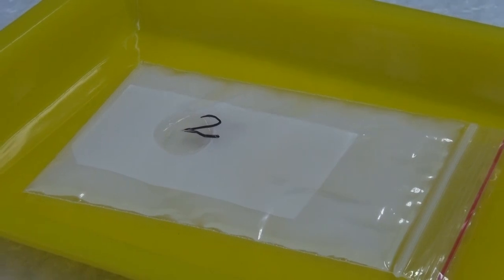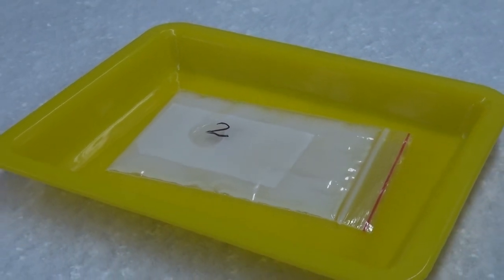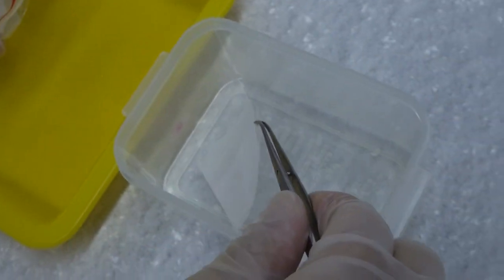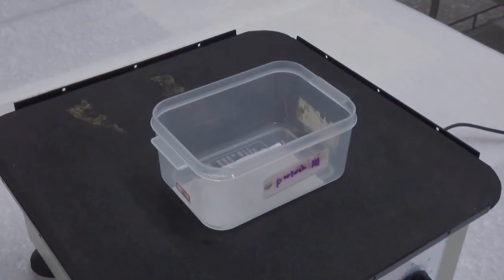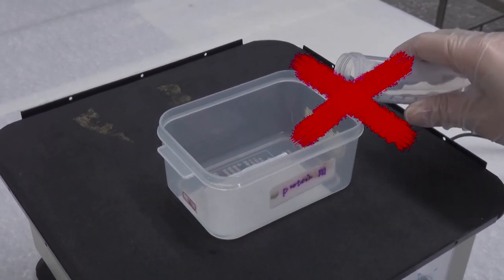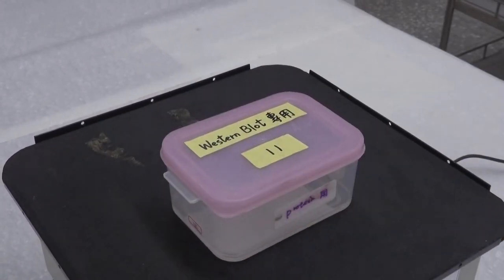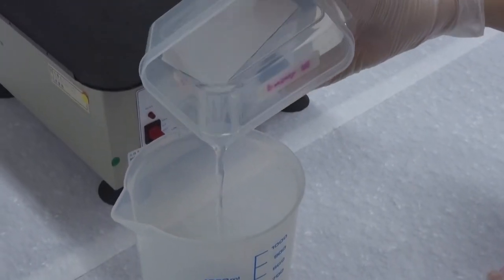Switch the water with 20 ml blocking solution and gently shake the box at room temperature for 1 hour, then decant the blocking solution. Rinsing with the washing solution after blocking may reduce the effectiveness of blocking, but if the experiment requires such a step, wash the membrane with 20 ml washing solution by shaking for 10 minutes and decant the washing solution.